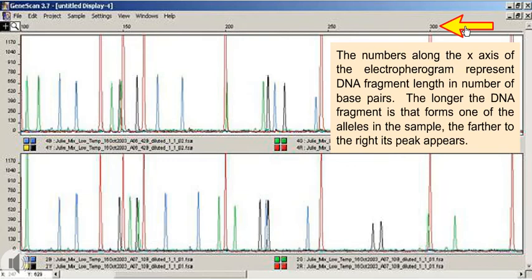The numbers along the x-axis of the electropherogram represent DNA fragment length in number of base pairs. The longer the DNA fragment is that forms one of the alleles in the sample, the farther to the right its peak appears.